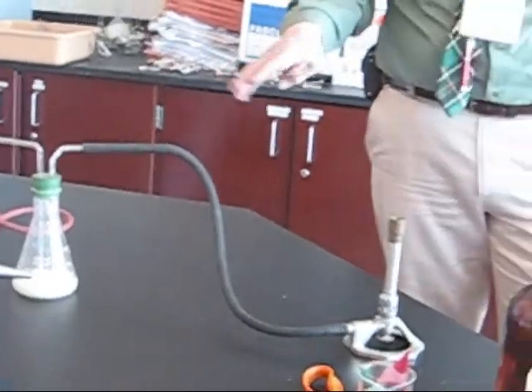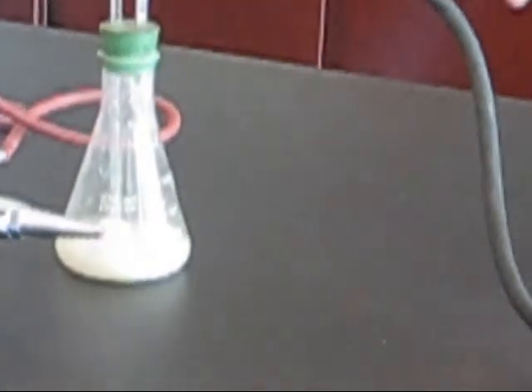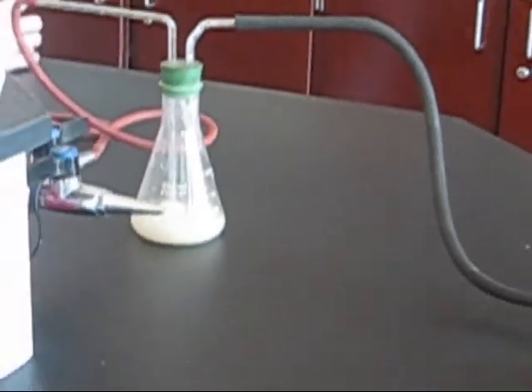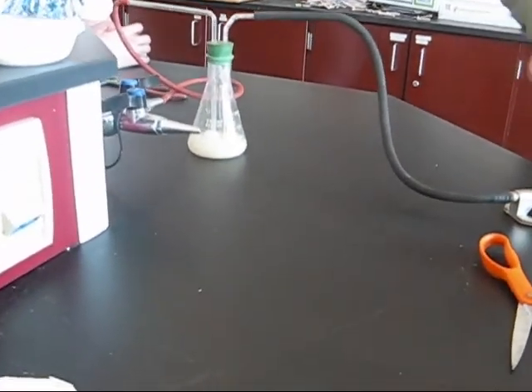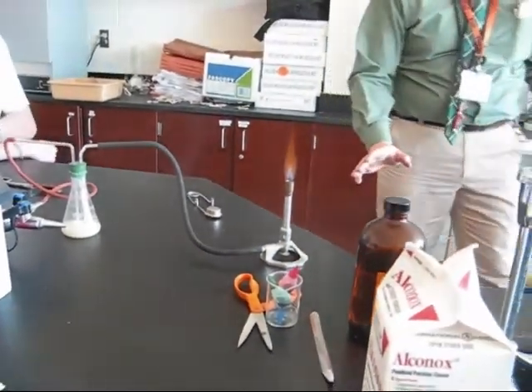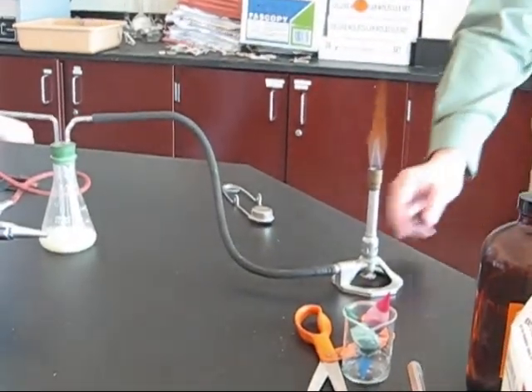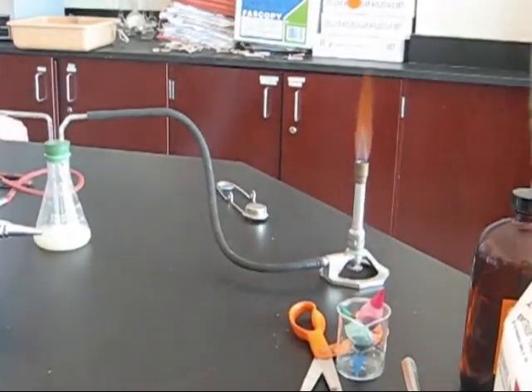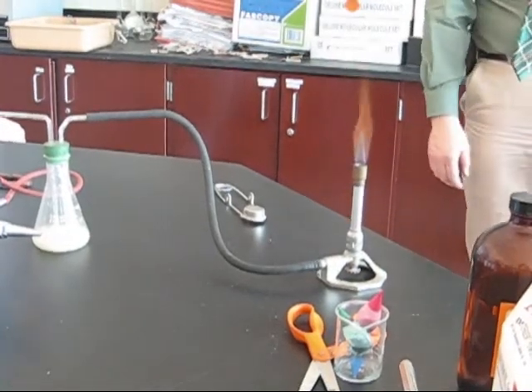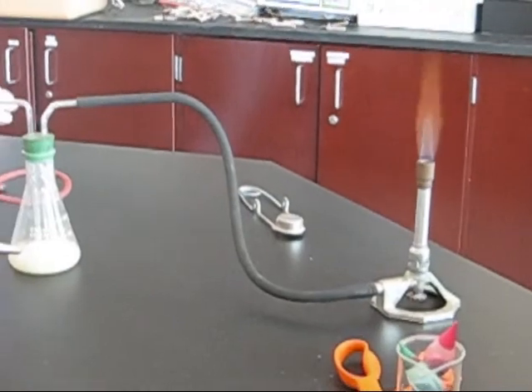So methane passes through the boron solution, so we'll gather some of this stuff over. It'll come over and we'll use it to light the flame. It should be hard to see, but what you should see is a green tint to that flame. I see it on the outside. Maybe we can shake it around a little bit and make the flame dirty. If it's dirty, it'll just be yellow.